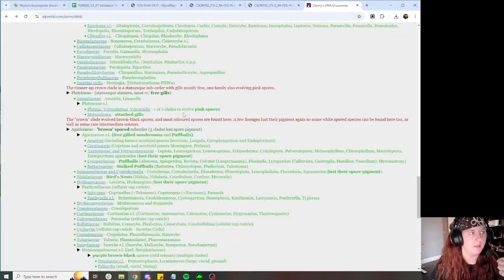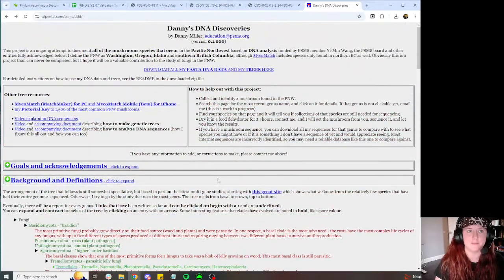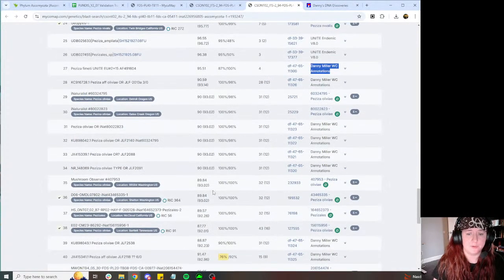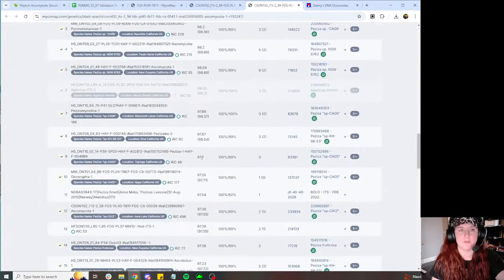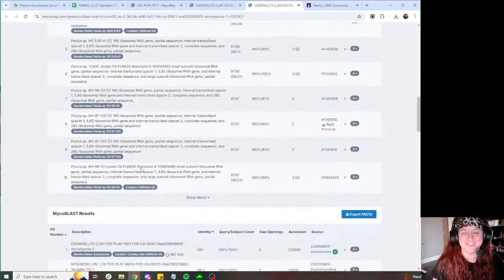This is his website. And honestly, since you're in Washington, if you ever have questions about mushrooms, you can totally go look at his website here and it might help you figure some stuff out because he's got really detailed notes on a lot of different stuff. It'll pull stuff from Mycoportal and from iNaturalist and Mushroom Observer. So we can compare not just against NCBI BLAST, but also against the local database, which helps because a lot of the stuff in NCBI isn't well curated. It looks rough, but it's functional.